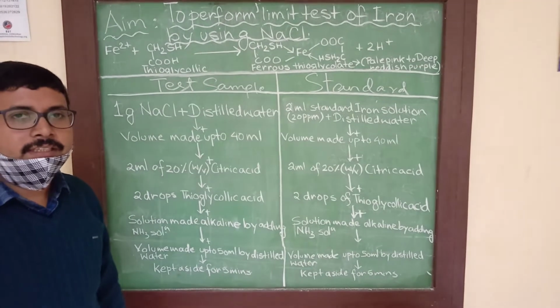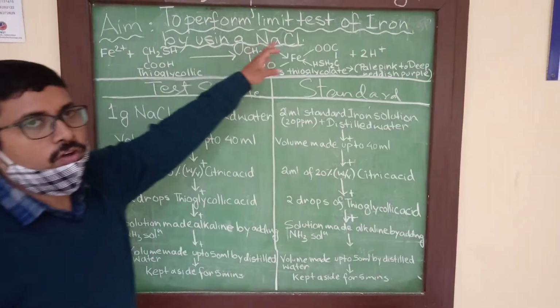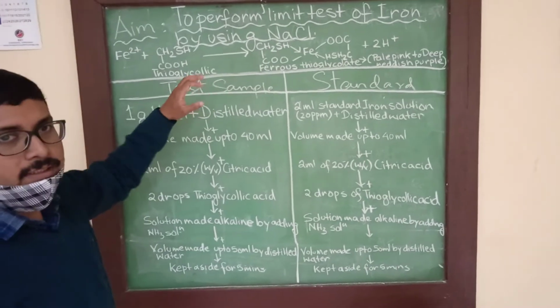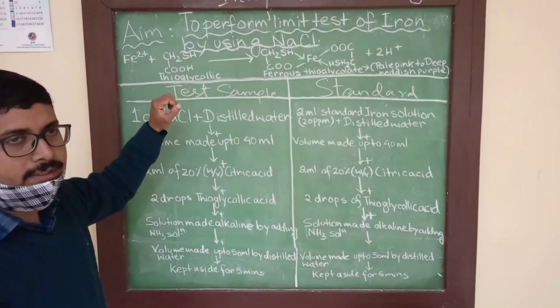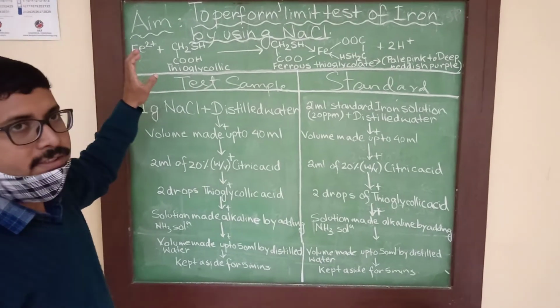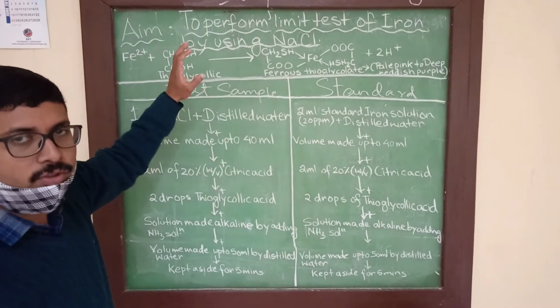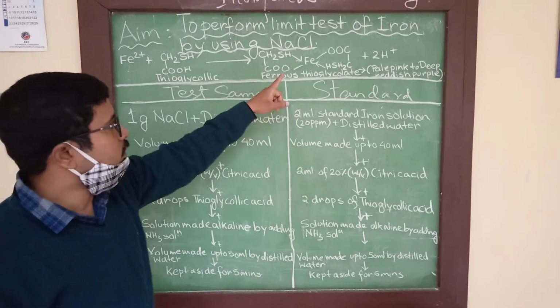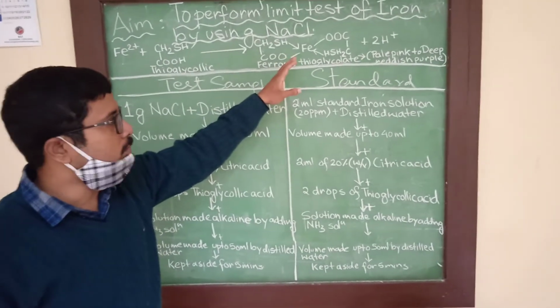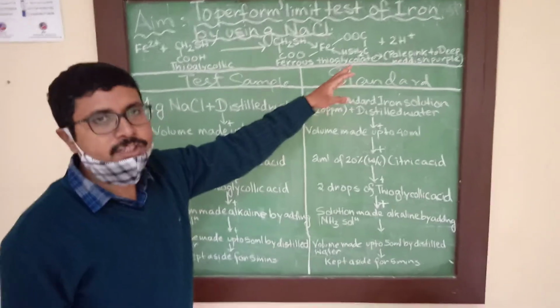So today in the inorganic lab we are going to perform the limit test of iron using sodium chloride, or NaCl. So here the principle of this experiment is that iron in Fe2+ form reacts with thioglycolic acid in presence of citric acid and ammonia solution to produce a complex which is ferrous thioglycolate, and the color of the complex is pale pink to deep reddish purple.